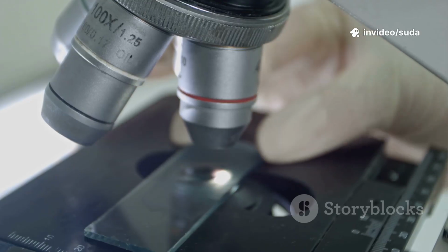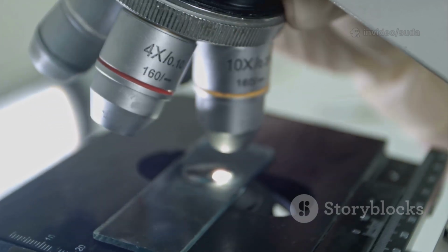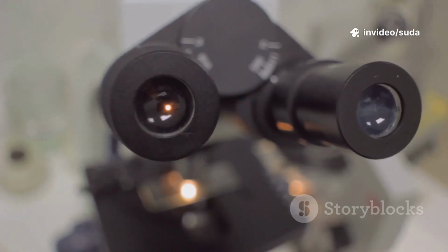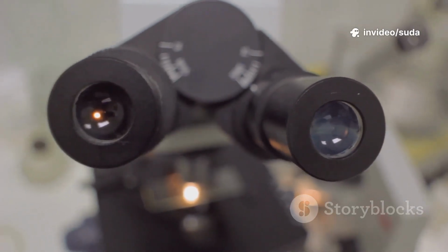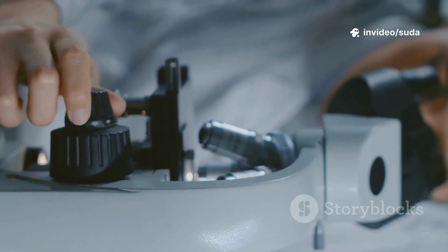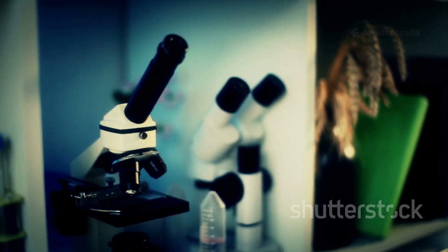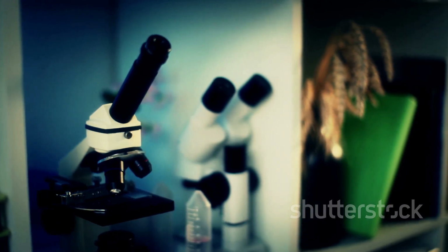The stage is the flat platform where you place the slide. Clips hold it securely. Below is the light source, shining through the specimen. The diaphragm controls how much light gets through. Two focus knobs, coarse for big moves, fine for tiny adjustments. Carry by the arm. The base keeps everything stable.